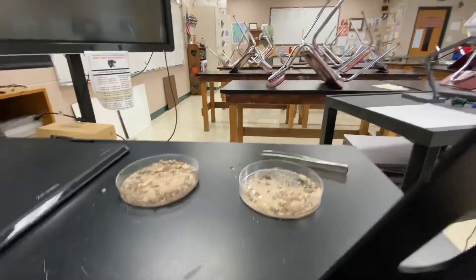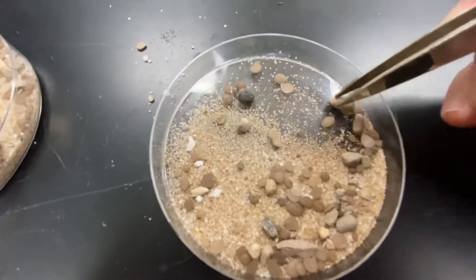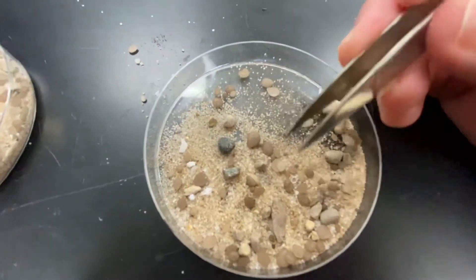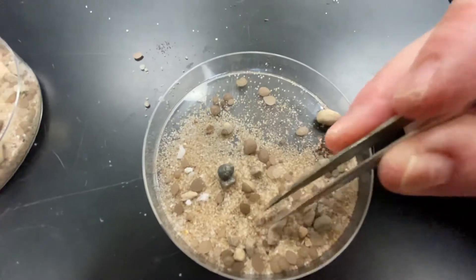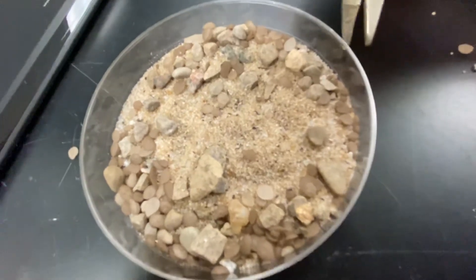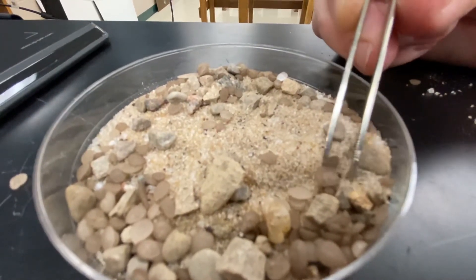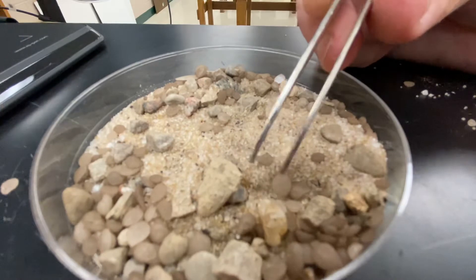Looking at the other contents, there are obvious rocks and pebbles — much bigger particles. There are two types of bigger particles: one type looks like rocks and stones, and the other type is these little circular things that are kind of flat on one side.